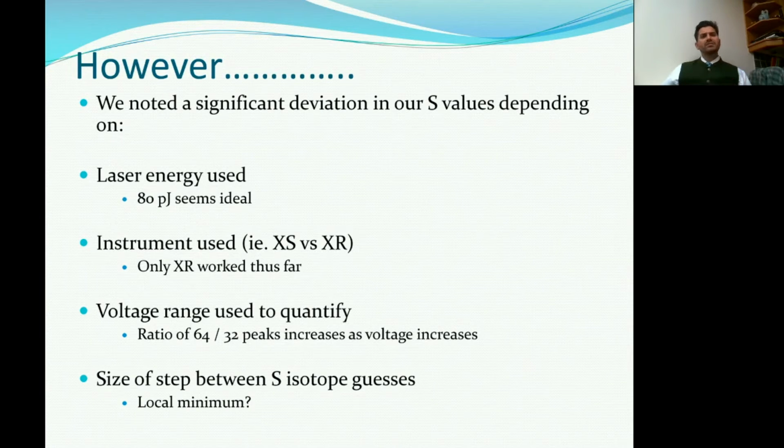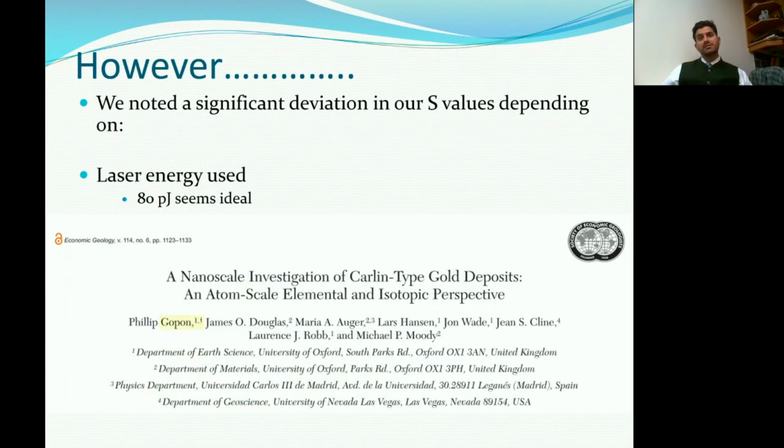And how we define the grid search also seems to have a bit of an influence on the numbers that are put out, sort of whether it's an even or an odd number of bins, and whether we end up on a local minimum there. The first paper on that is what came out last year, which is presenting the code, but only really for the relative differences. We've done a lot more work now, and hopefully the next paper will be out this year, where we'll also release the code.